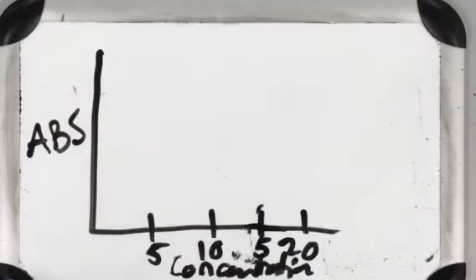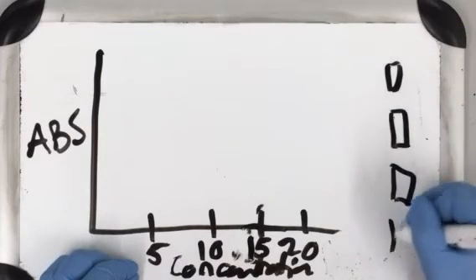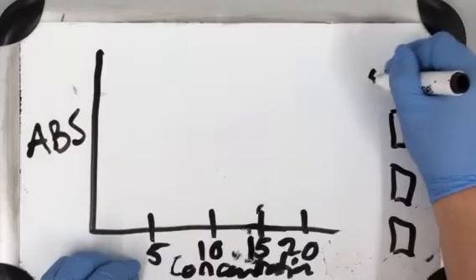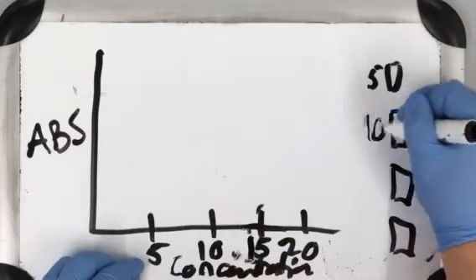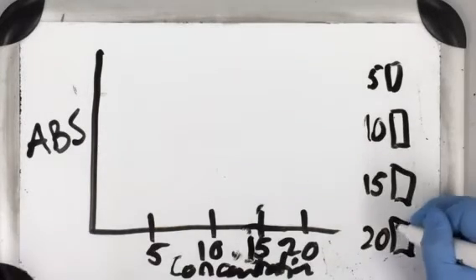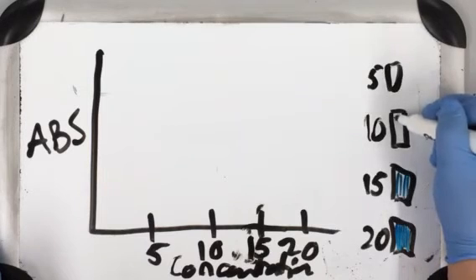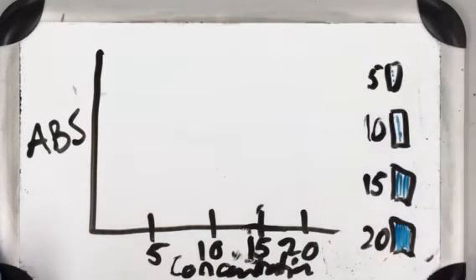If we make our own solutions and we know, like say we use milk protein as the control, and we have 4 tubes, and in one of them, there's 5 concentration. In the other, there's 10, 15, and 20. So the amount of blue we're gonna see is really heavy in this one, pretty good here, not much here, and barely any in there. Because the more protein you have, the more Bradford reagent's gonna shine blue.